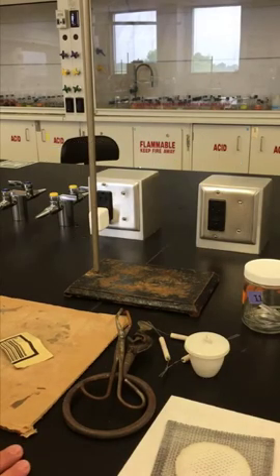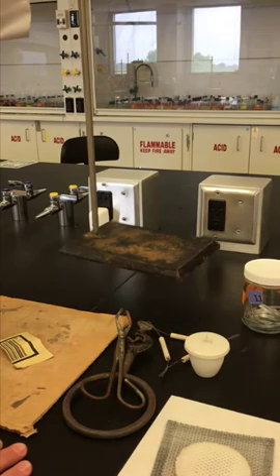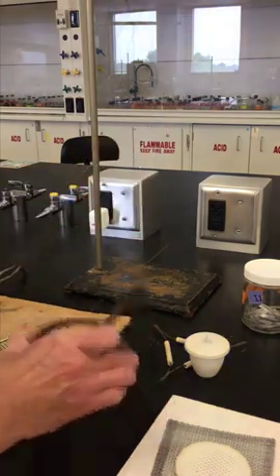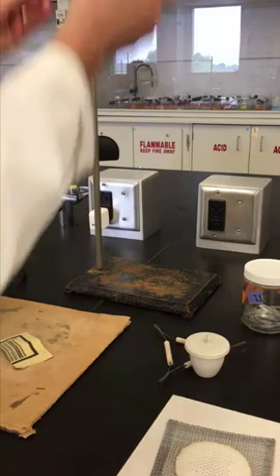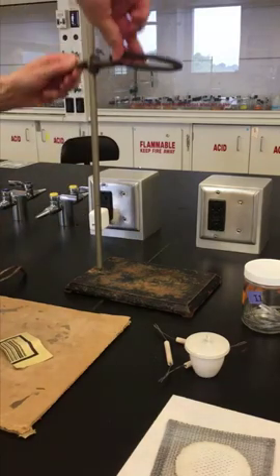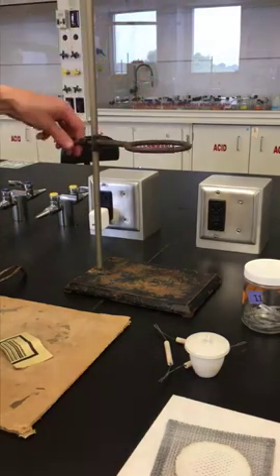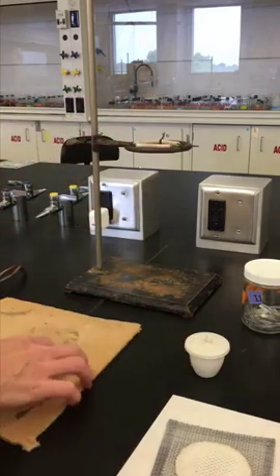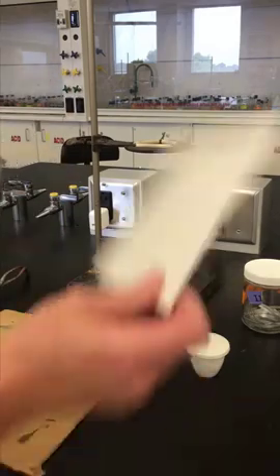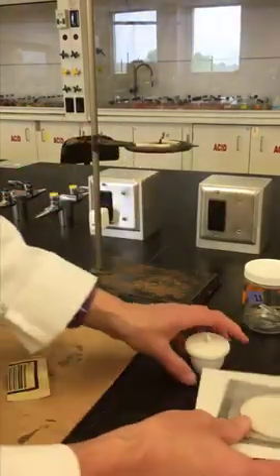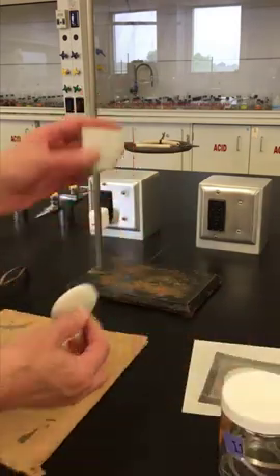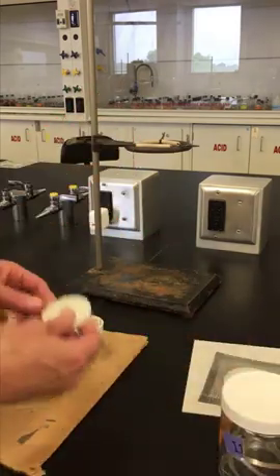We are doing the Empirical Formulas Lab and the equipment that you need for this is a ring stand, some crucible tongs, a ring support which will go onto the ring stand, a clay triangle, you are going to need a wire gauze and a ceramifab which we are going to use like a hot trivet. We are also going to need a crucible and the crucible cover.